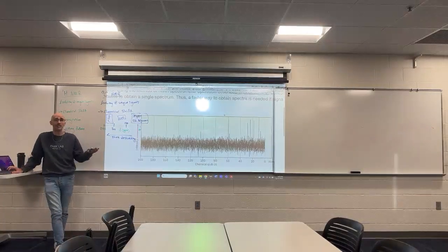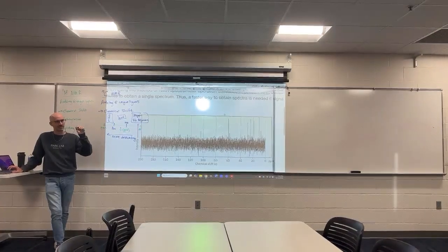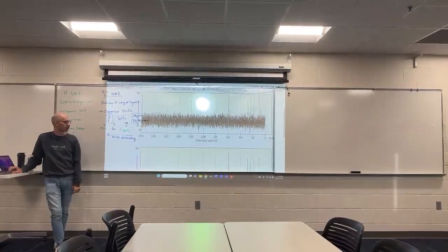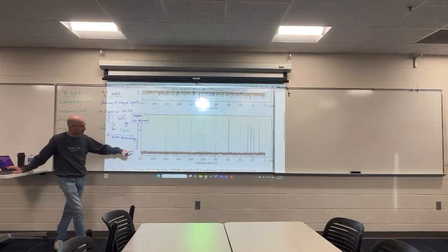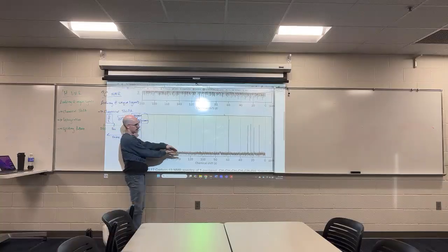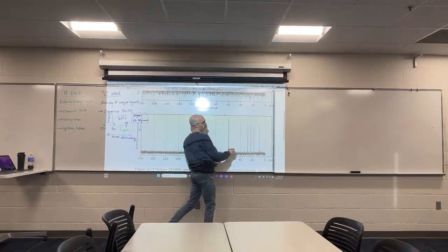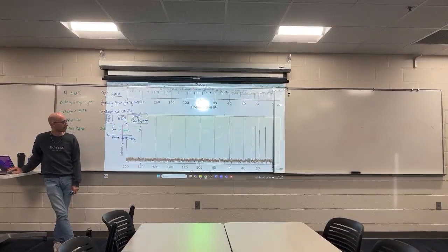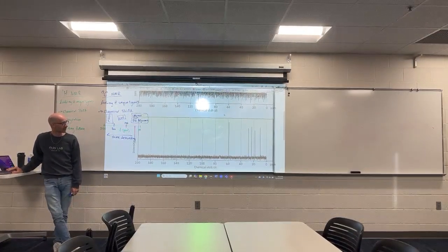So because carbon NMR is so dilute, there's such a few number of carbon-13 nuclei. You need to run several scans over the course of several minutes and then average them all out so that the noise gets compressed and the actual meaningful information comes out. How many unique carbon types in this compound based on its NMR? 5. 1, 2, 3, 4, 5.